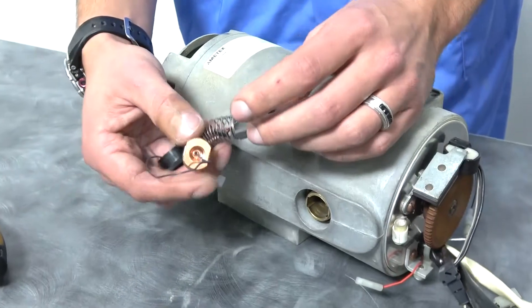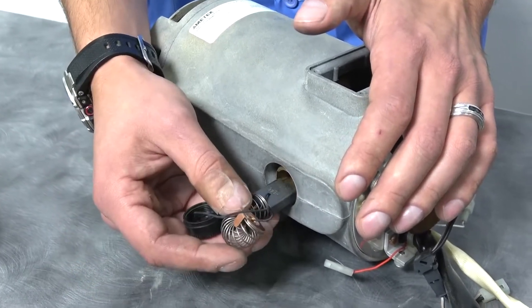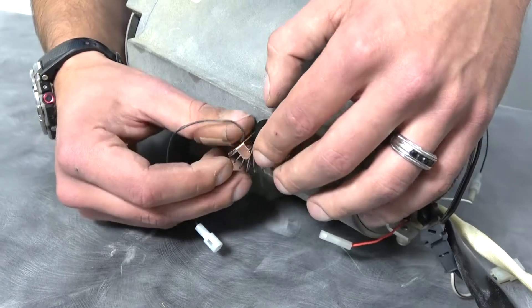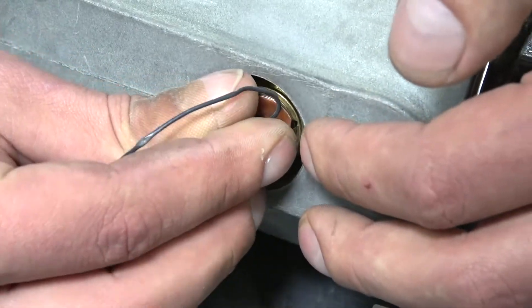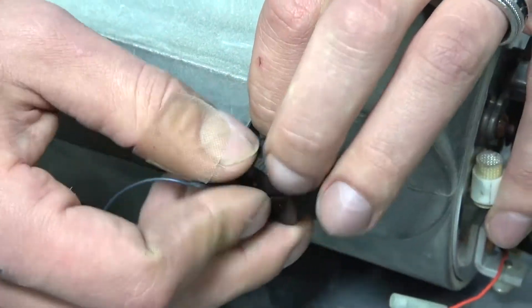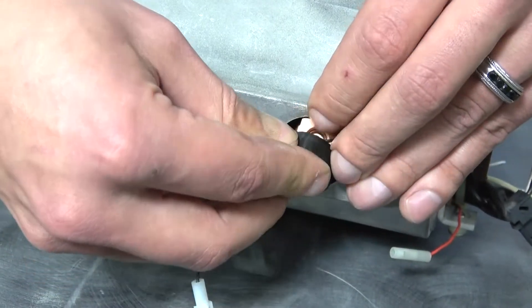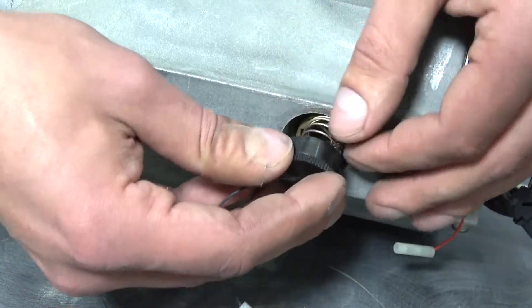Then you would take your new brush — we don't have new brushes right now — but for the procedure you would put it right back in, just like you took the old one out. You want to line up these tabs here with the hole, otherwise you'll have problems getting your cap on. Then the complicated part is getting your cap up while keeping your tabs still in place, and it can be a little bit of a hassle, but eventually you should be able to get it. Sometimes putting it in the cap helps too.